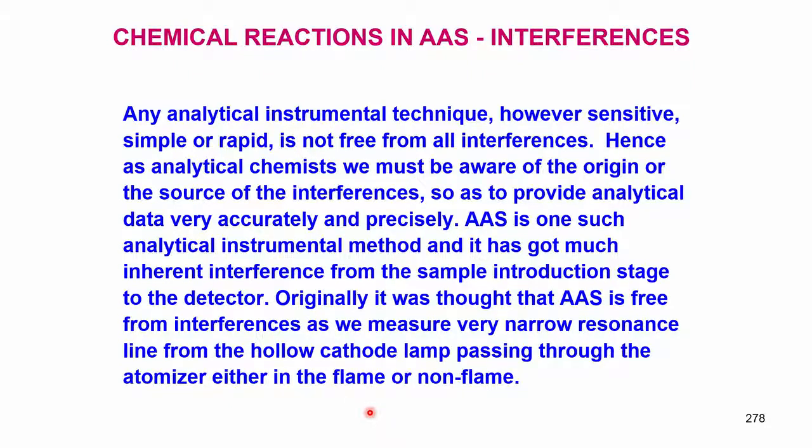discuss here, and it is important for us to understand what are the chemical reactions taking place in atomic absorption interferences. Okay. So, any analytical technique for that matter, however sensitive, simple or rapid, is not free from all interferences. Definitely it won't be free from all interferences. This we have been discussing since quite some time now.